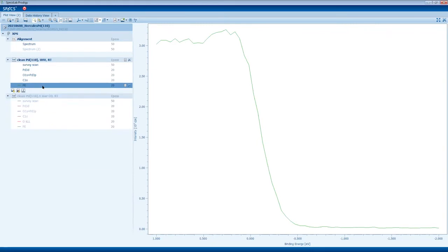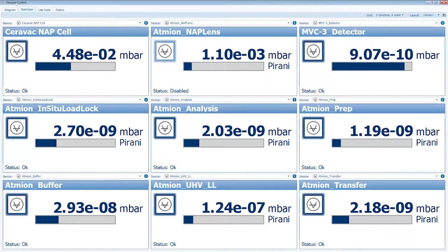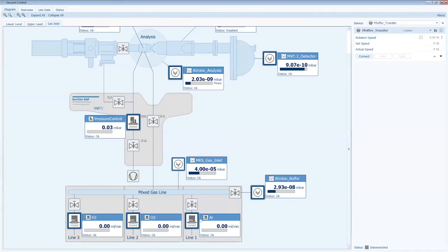however, you use the flow controller which is for argon, and there are slightly different constants, and maybe we can recalculate it here, and we know that we need to use 2 milliliters per minute for oxygen and 1.3 milliliters for hydrogen in order to have this 2:1 ratio inside the mixture.